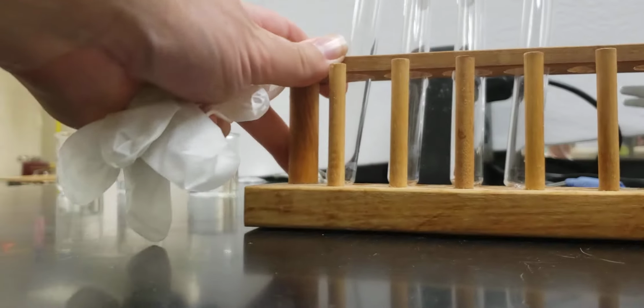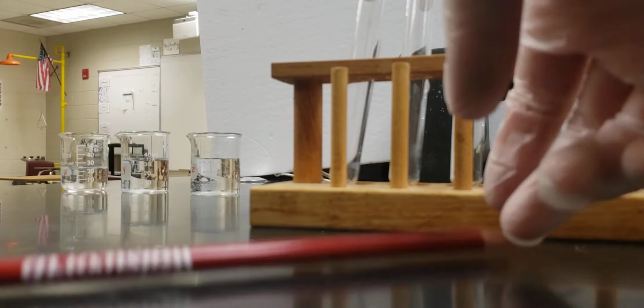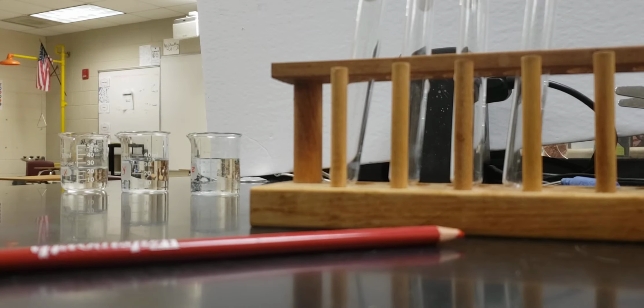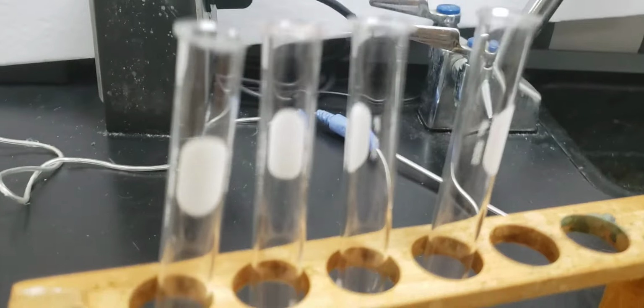To help us do that, we're going to take a grease pen. A grease pen in this classroom is going to be a red pen like this. It has a marker on it, and we will be able to label them.